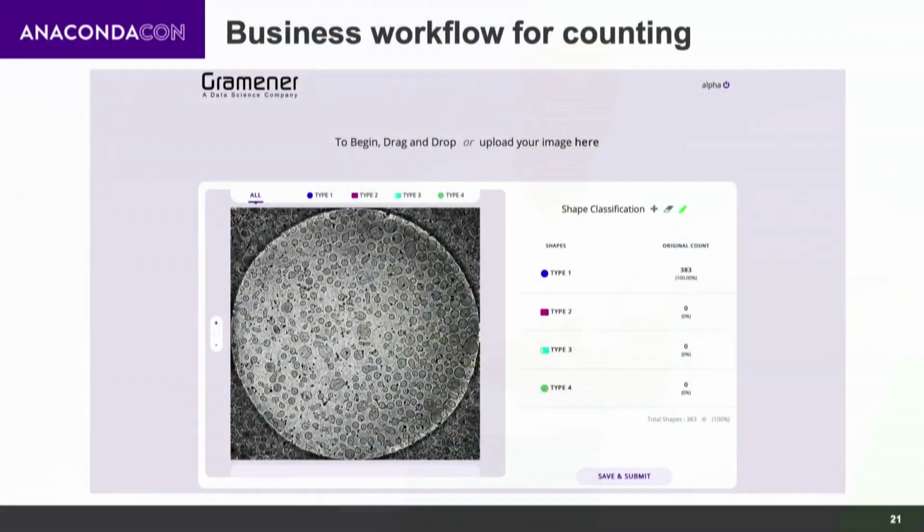back onto this image. So once we did that, we had to show this on a UI to the users. So we built a UI. This is what it looks like. We let them upload an image or a bulk set of images, so you can just point it to the location from where the microscopic images are stored. And after you save it, the cleaning and model counting gets initiated.